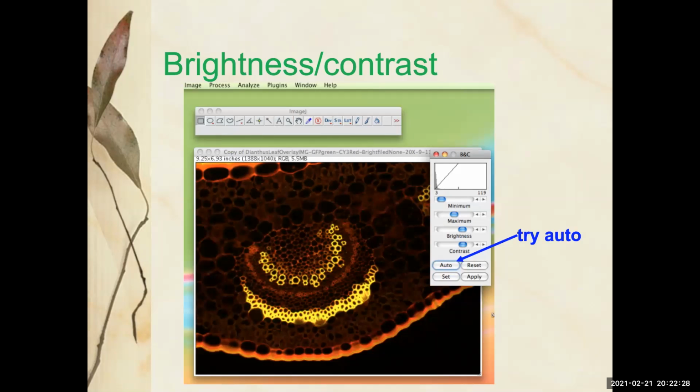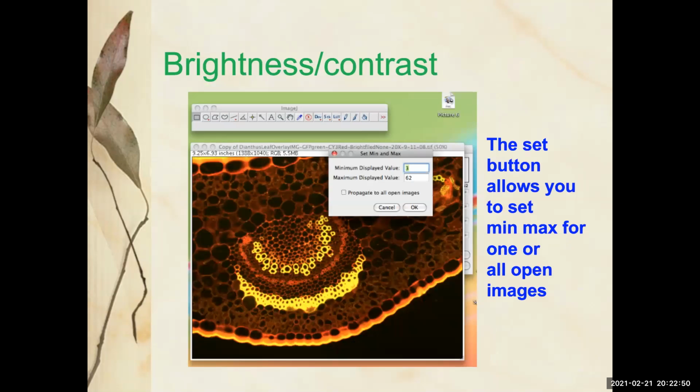Usually almost everything automatic on imaging software is not satisfactory. Weirdly enough, you'd think it'd be easy for them to figure it out, but it's not that good. We're usually better. It's one of those, I hope I'm wrong soon. I think I will be wrong in a year or two, but until then, don't trust the computers. Use the computers. Your brain is still better for the moment. It can show you the actual values if you want to look at that.